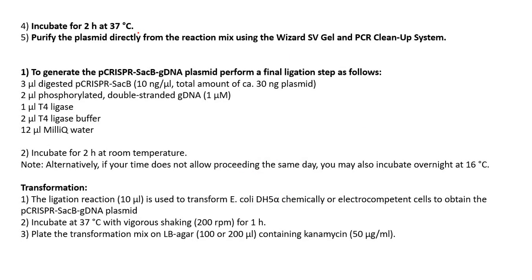Incubate for 2 hours, following the manufacturer's instructions. Purify the plasmid using the PCR cleanup system. You can purchase it, or if you are working in a university, you might already have it. Then you have the cleaved plasmid, and you have your ligated gRNA, sorry, gDNA.